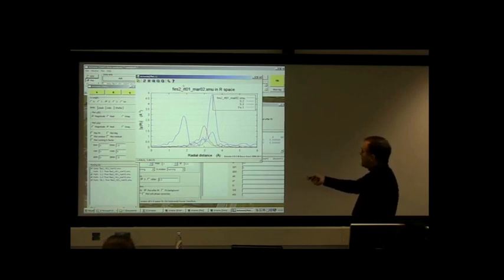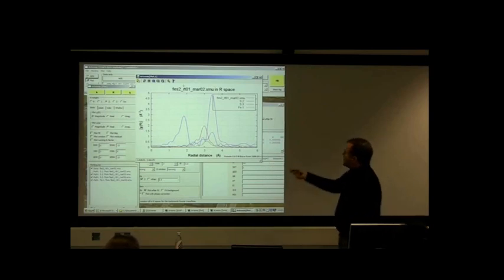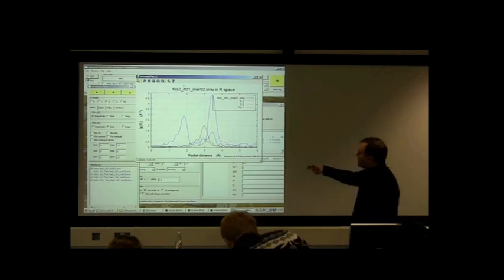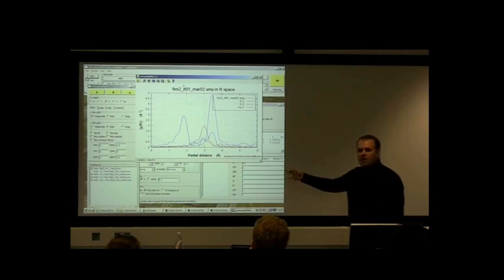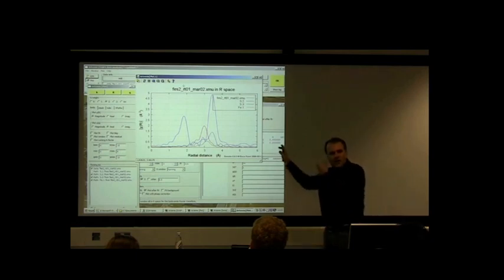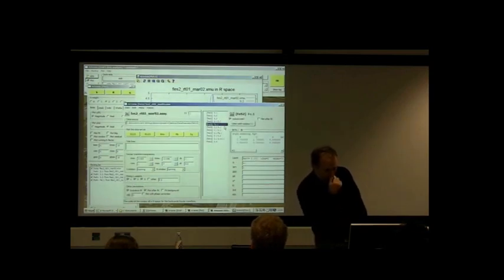The details of how these two peaks arise has something to do with, at the very least, how these three paths are going to add together, because all three of them contribute spectral weight all throughout this range. So what we've seen so far is that the first path contributes the preponderance of the spectral weight to this peak. But this blob of peaks right here is apparently going to be some kind of complicated combination of several things. Well, it really could be quite a bit more complicated than that. We have some more things to look at.